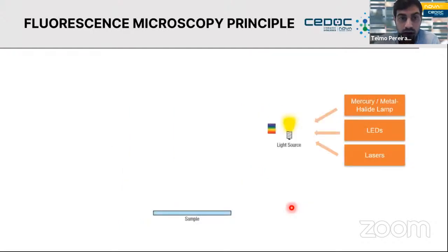Okay. So now that we know how a fluorophore and fluorescence work, we need to put this into practice in our microscope itself. Davide already showed you a similar scheme as this. I will try to show you this again, because it's very important for you to understand how these microscopes work, because most of the microscopes you have access to have this or a similar light path.